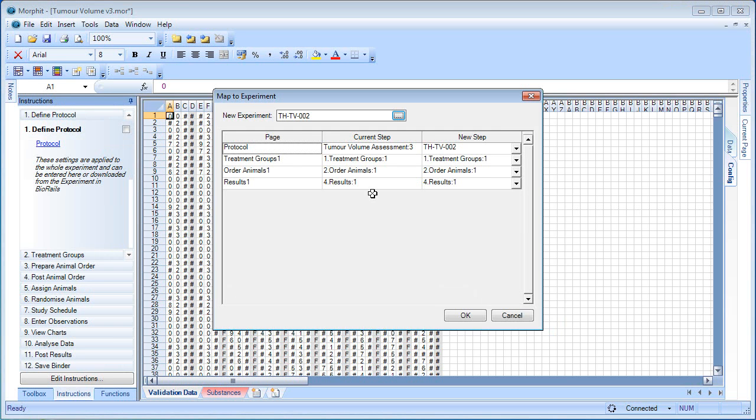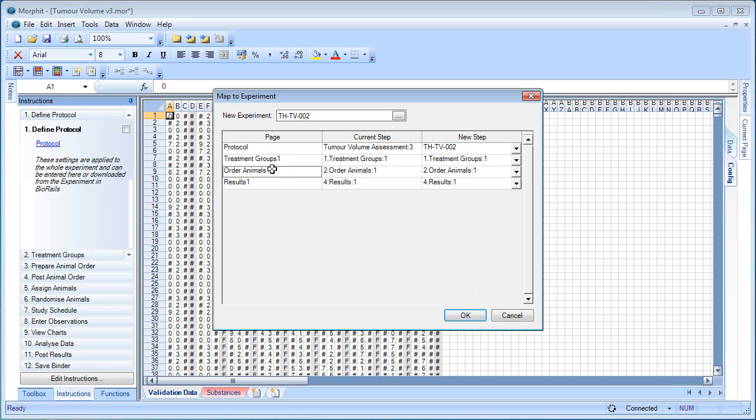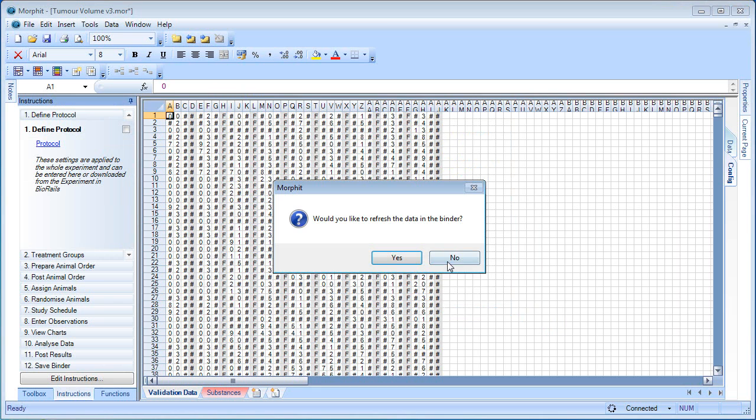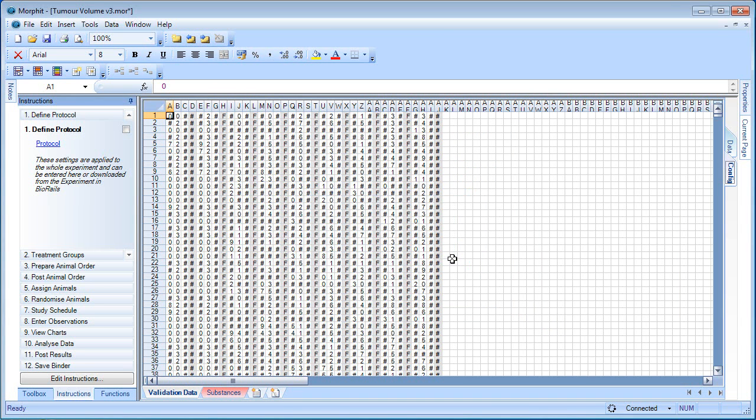As the binder opens, there's a double check to ensure that we've got the correct task mapping. Essentially this means that the binder has been mapped correctly for each of the steps in the experiment onto each of the pages. So that's fine. And we've got the option of downloading any data that we may have previously entered in the experiment.